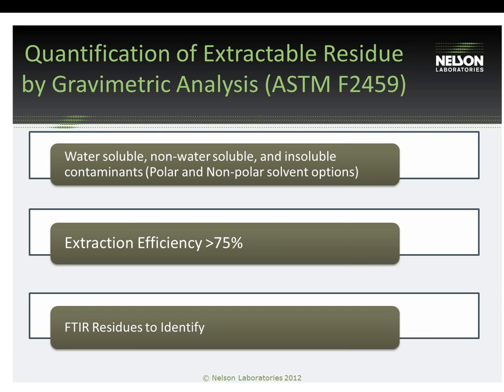And the extraction efficiency can be determined two ways. The first being a spike recovery, where we take a clean sample that's gone through your process, we spike or dope it with a known amount of the contaminant, we do one extraction to get a percentage of those surface residues that we were able to recover. And so that's one option to determine the extraction efficiency.